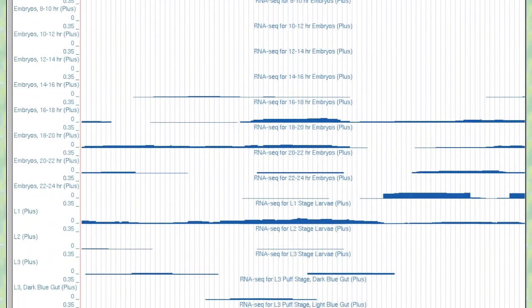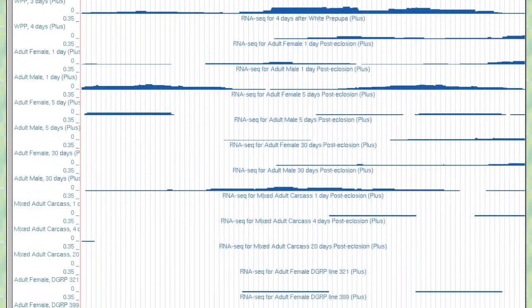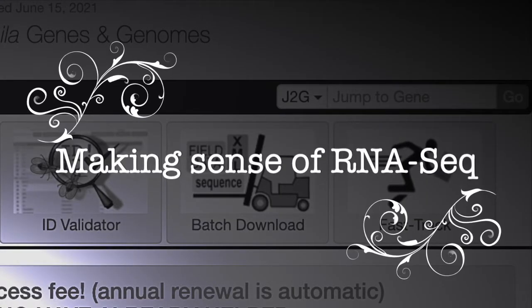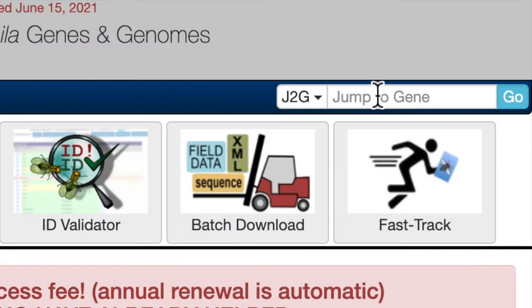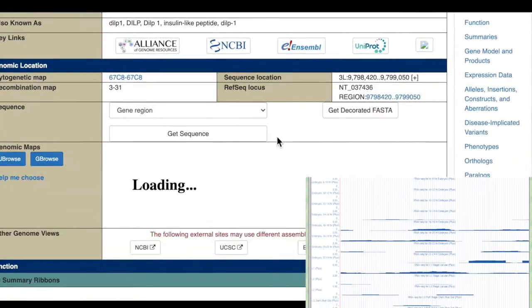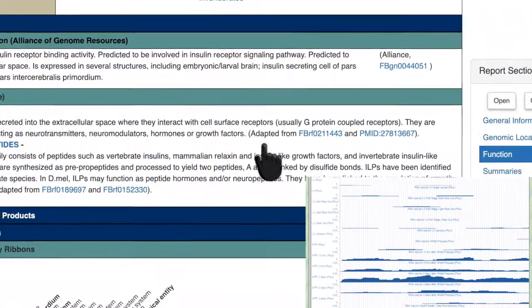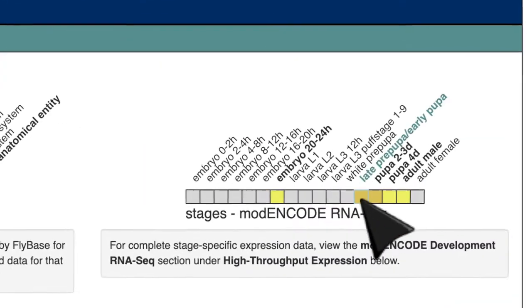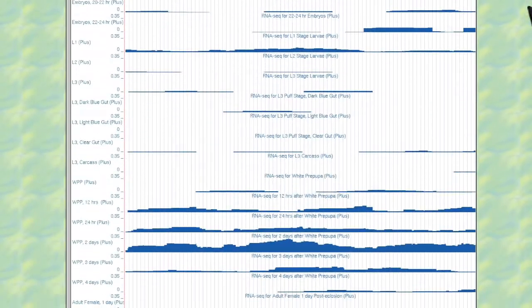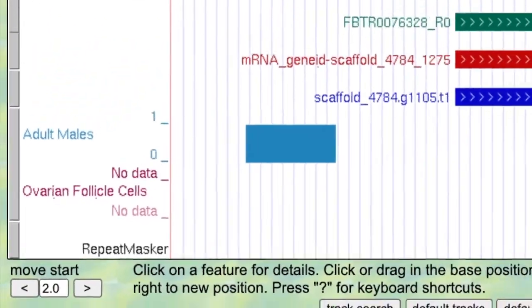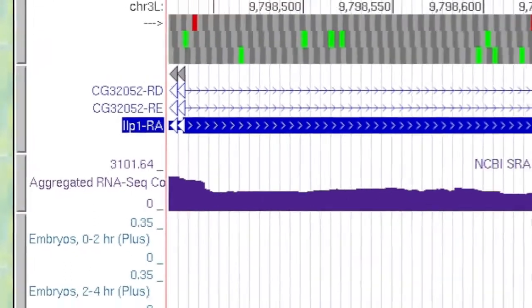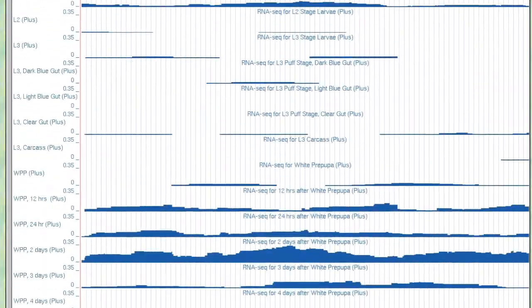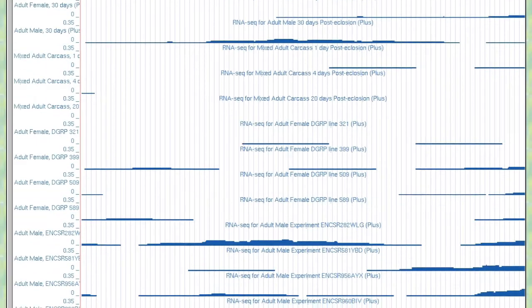It's also crucial to take into consideration the type of RNA-seq we're looking at in relation to our gene. Take ILP1, or insulin-like protein 1, for example. By doing a quick search on Flybase and looking at our RNA-seq tracks in the UCSC Genome Browser for Dmel, we can see that this gene is expressed during pre-pupal stages and is generally inactivated within the first week of adulthood. This could be a problem if our target species only had adult RNA-seq or even aggregated RNA-seq, because we won't get an accurate representation of the different ways it's actually utilized.